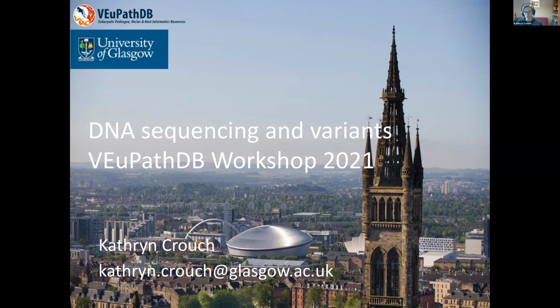I also want to just highlight here that although we're not going to use it today, in Galaxy we do have configured workflows for variant calling. So just like the ones used for RNA sequencing yesterday, we've got some for variant calling as well. So if you're interested in that, then Omar or Mark or myself would be good people to show you where to find those workflows and how to set those up.